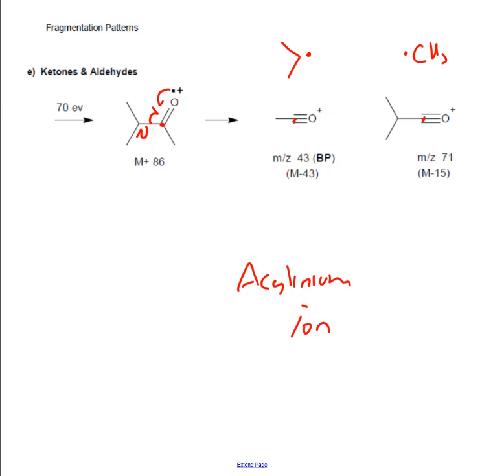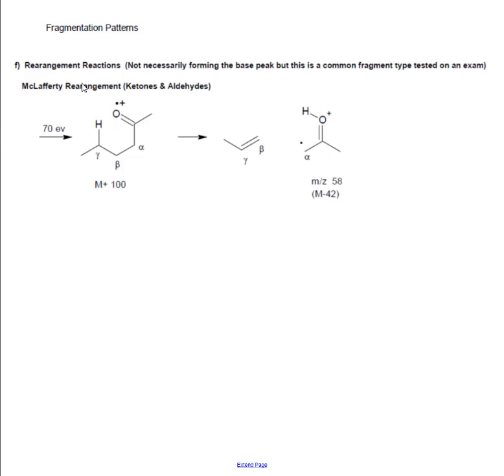And now the last thing I want to talk about is known as rearrangements. There are two that we're going to focus on. One is with a carbonyl and the other is with an alcohol. So this is called a McLafferty rearrangement.